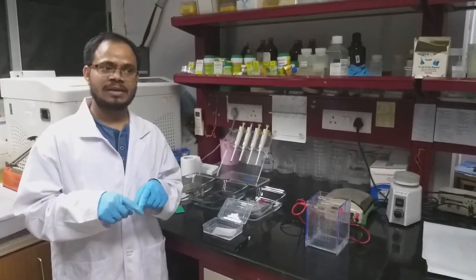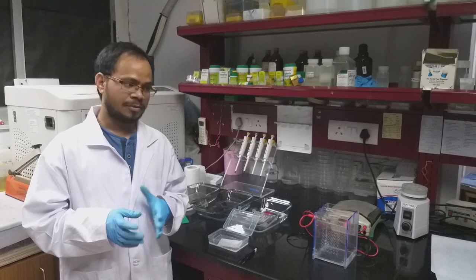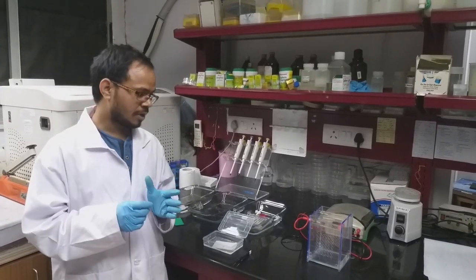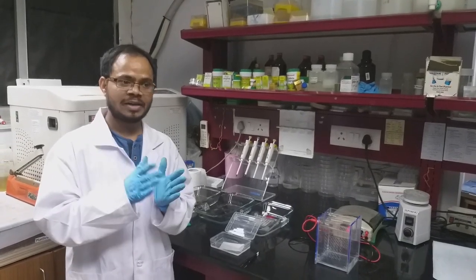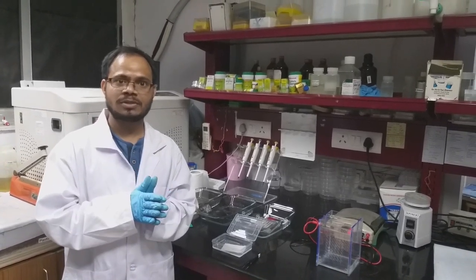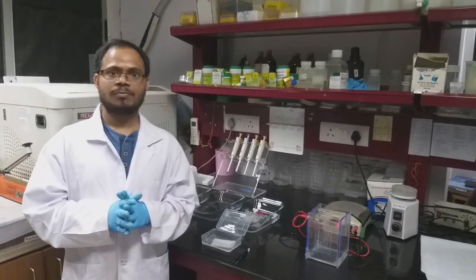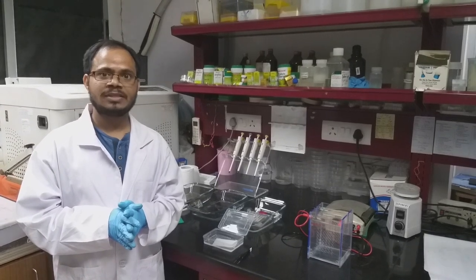we have to cut the part. If you have ready-made pre-cut blots, then there is no need. If you are taking from a bundle, you have to cut precisely for how many wells you want. After that, you have to label the front of the blot, where the front side is used for transferring the protein, and also in further steps like antibody incubation. If you want to use a PVDF membrane, you have to charge it with methanol.